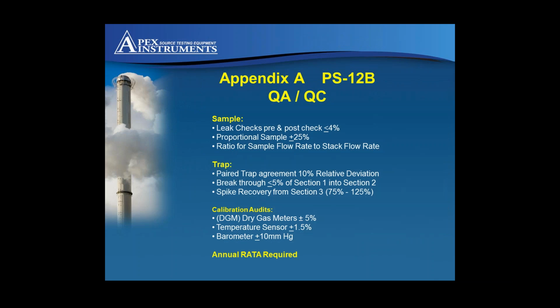And you can save profiles. Some plants have profiles for proportional sampling. If you're in the north or in the south where, in the wintertime, you're at base load, and then maybe in the spring you're not, they may have a profile for the proportional they'll use during those cold months, and then they may have one they use during the months when the demand's maybe not quite at base load.